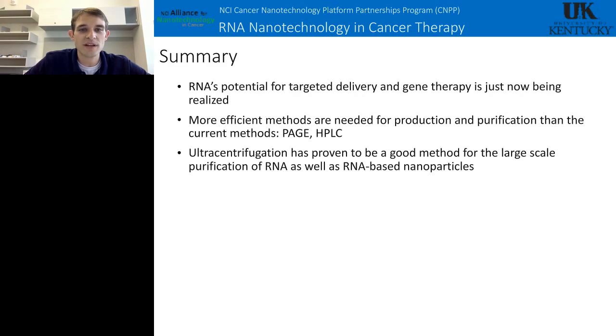So just in summary, I've kind of talked to you guys about why I think RNA is great, and why we need these different methods for the large-scale production of not only single-stranded RNA, but also the RNA oligomers. And I hope I've convinced you that this ultracentrifugation method can be used as a better alternative to PAGE or HPLC.